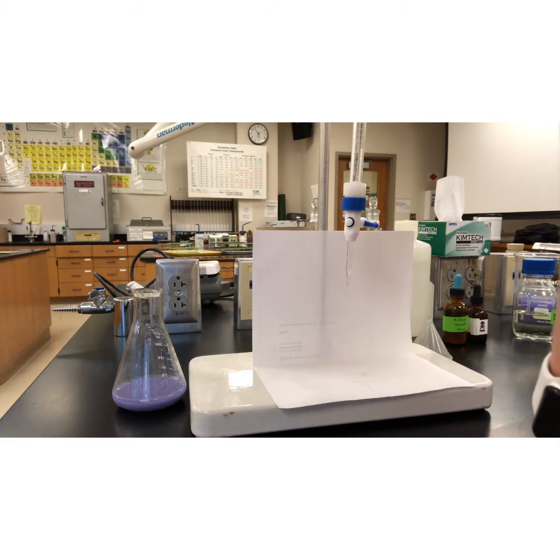Okay, here we go. 0.20 milliliters for V naught.